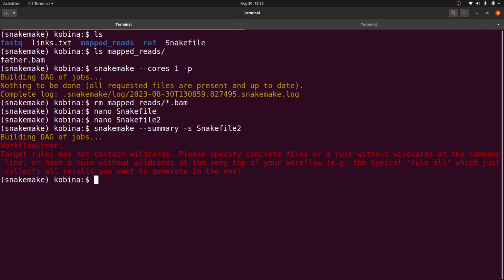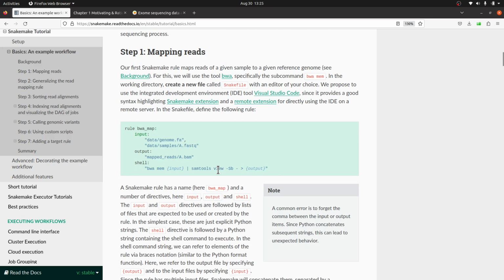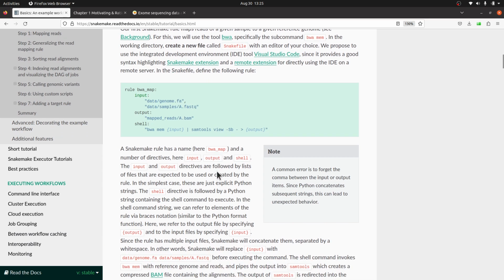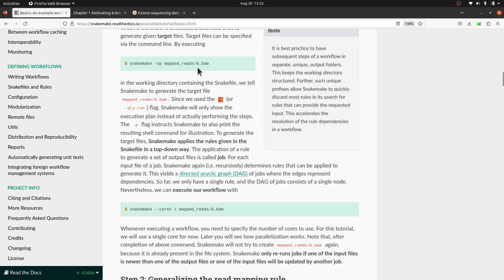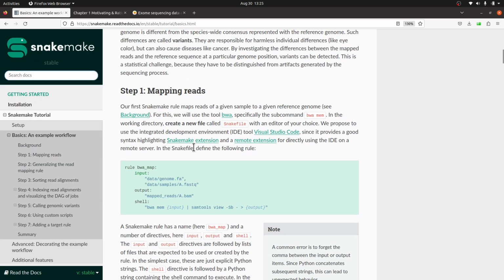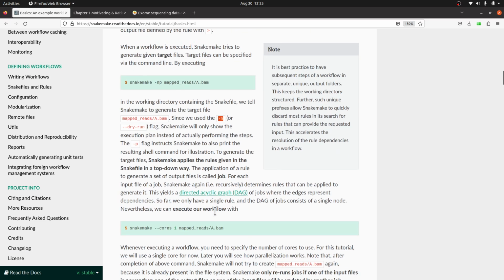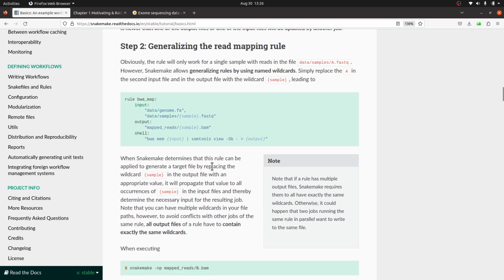Let's go to the page again. So this is the trick. We will do it here. We can specify an output, which in this case says a.bam. So we can say father.bam or proband.bam or mother.bam, and then that will be used to get us what we want. Now, with the first script that we wrote, we can still make changes, but we are still using the generic one. We've made it generic.